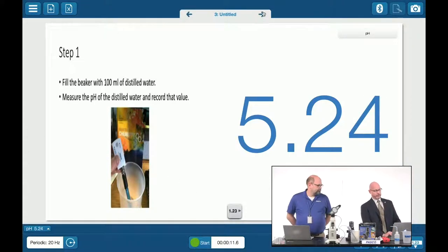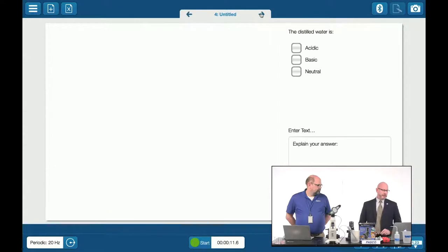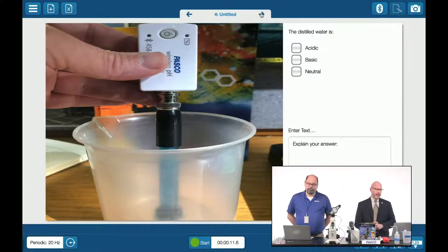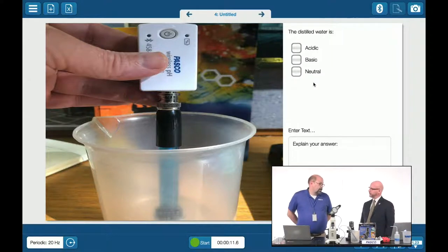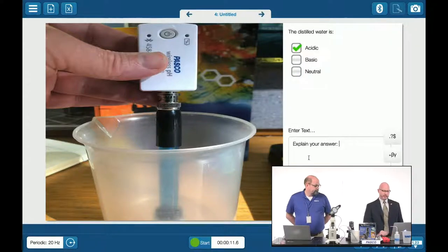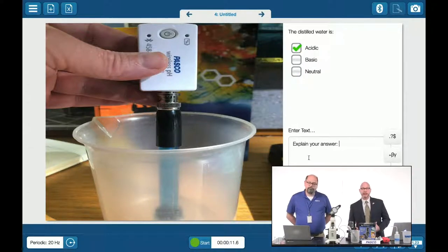Now, watch what happens next, Roger. I go to the next slide, and it's got another picture, shows what I did, and I'm able to even ask a few questions. Again, it's all part of the software. I've created a little bit of assessment. It was about 5.25. Roger, what is that? Acidic, basic, or neutral? We're in the acid range, so going to check acidic, and that's right. If I would have checked basic or neutral, it would have said no thank you. It's acidic, and I've got the opportunity now to actually explain my answer.